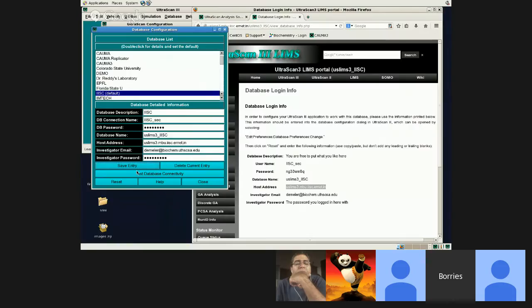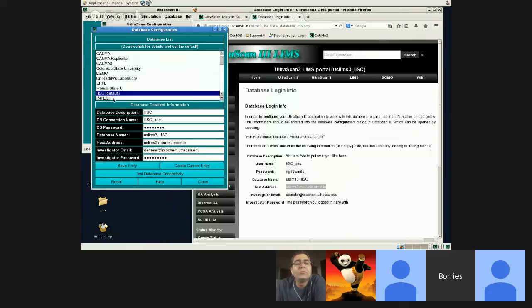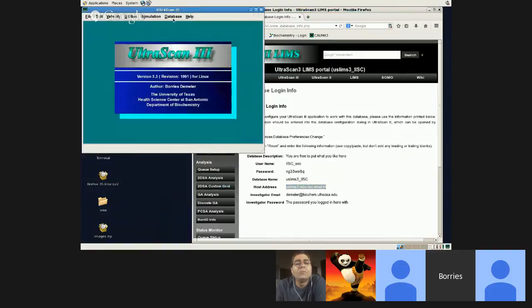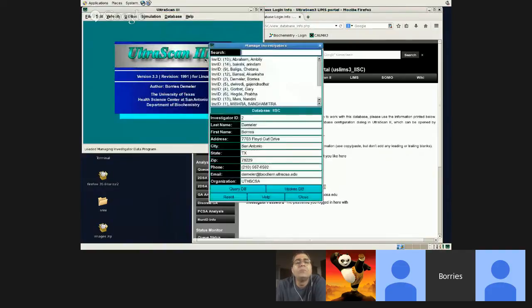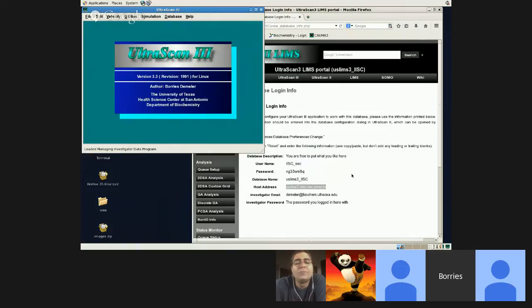Okay? And then once it's saved, you can make it the default by double-clicking on it, or if it's the only one there, then it'll automatically be the default. So now we're done with the setup of the database, and you can quickly test the database by going to Investigator Data, and it should list the same users that we saw a minute ago when we were trying to update the user level. When you see that, you can be sure that you have good connectivity and that your computer can connect to the local server and retrieve data from there or upload data to there. So, okay, that's the first thing that we have.